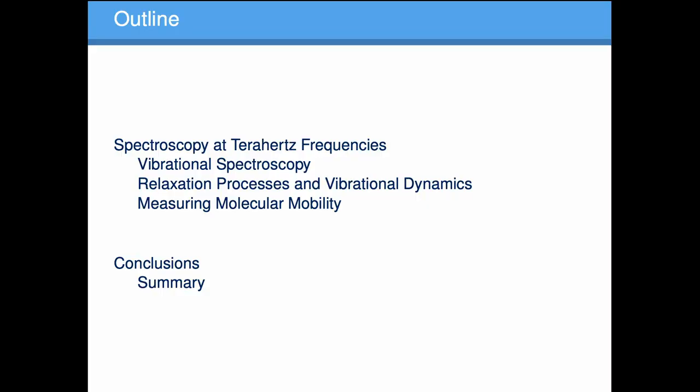Now, Terahertz Spectroscopy is a method that's been around commercially for about 20 years or so, but it is not as widely used yet as some other spectroscopy methods. As with all methods, it is really important to understand how it works, what limitations it has, and how it complements more commonly used analytical techniques.